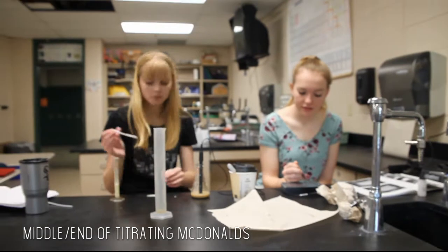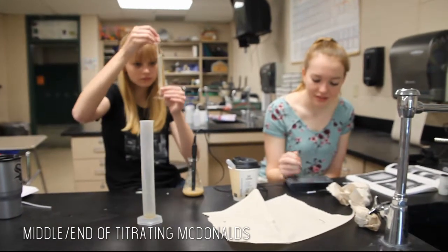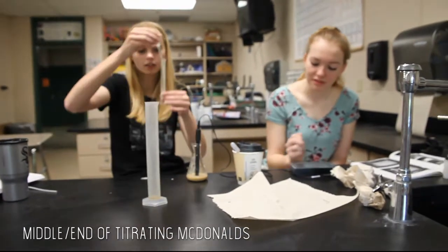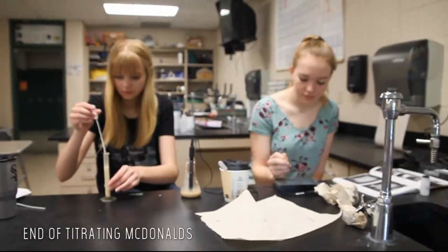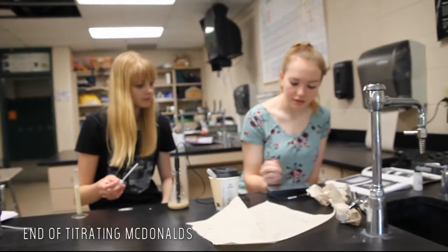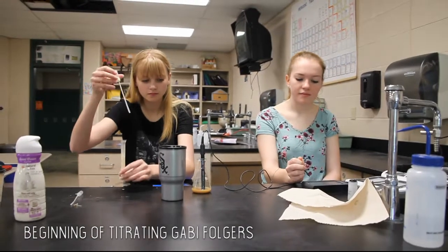We then repeated all of these steps using the McDonald's coffee. Unfortunately, our videographer doesn't know how to use her camera well, so you will just have to deal with this blurry footage of the McDonald's titration. Lastly, we finished off our experiment by repeating the steps again but with the Gabby home-brewed Folgers coffee — and with not blurry footage.